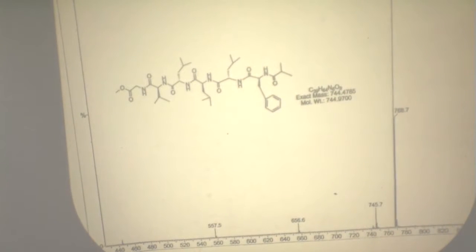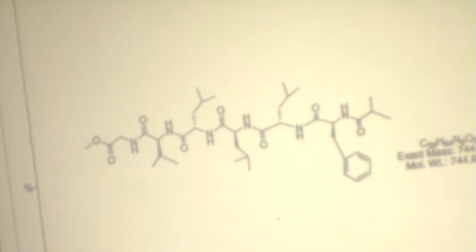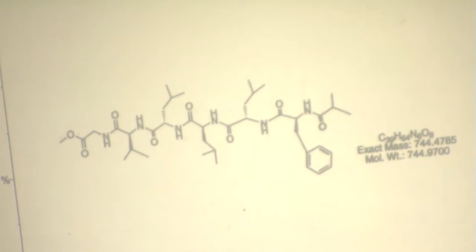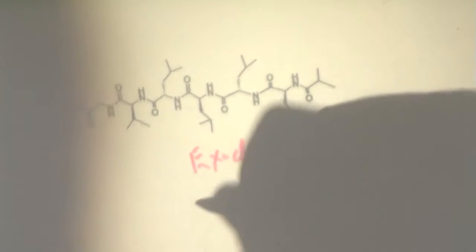All right, so this is a handout of a particular molecule. This one happens to be an example of a peptide. Now we're going to talk more next time, but one of the big concepts is you're separating molecule by molecule, which means you're looking at individual isotopomers. Put simply, 99% of your carbons are carbon-12, 1% of your carbons are carbon-13. So when you calculate a mass for mass spec, you're going to actually calculate the exact mass. That's based on the predominant isotopomers.